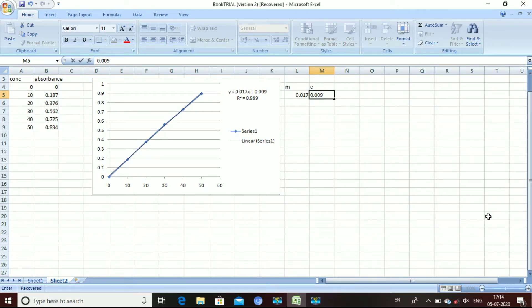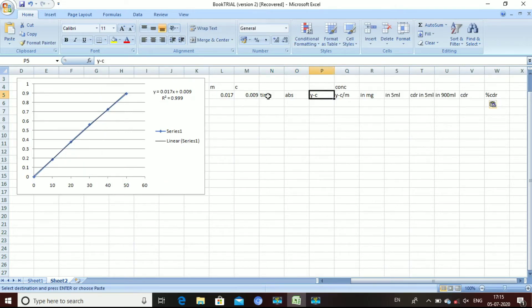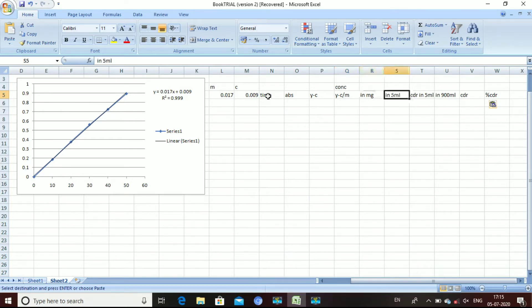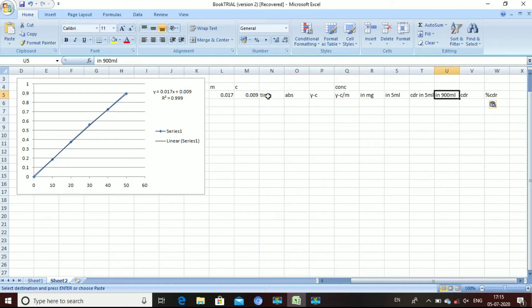We will set up the following columns: the second column is absorbance, the third column is y minus c, and the fourth column is y minus c divided by m, which gives us concentration. The next column is the amount in mg, followed by cumulative release in 900 mL, and the last column is percentage cumulative drug release.